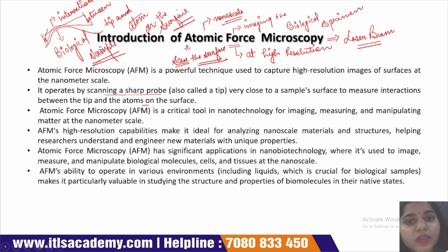What is atomic force microscopy? Atomic force microscopy is a type of microscopy by which we easily visualize nanoscale structures, and we capture a high resolution image. The basic principle of imaging is a scanning process. The cantilever tip of the atomic force microscope scans the surface of the sample and visualizes the image. Atomic force microscopy plays a most important role in the field of nanobiotechnology.